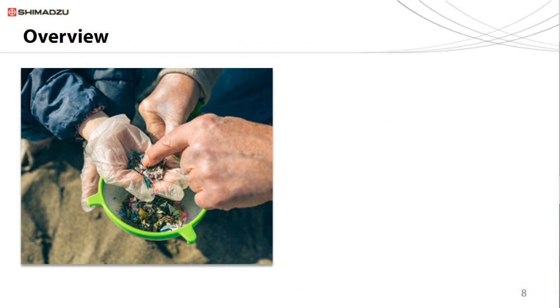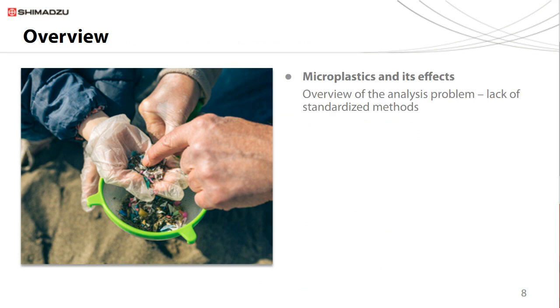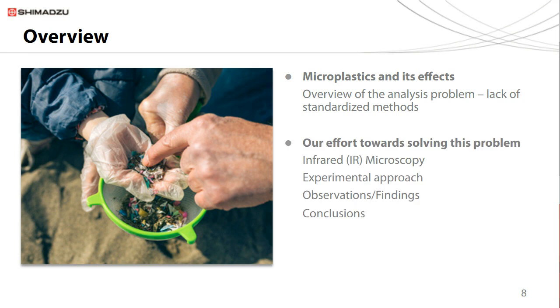Thank you, Ruth. As we transition to the next part of the presentation, I'll briefly provide an introduction to microplastics and the effect it has caused to the environment. Then, I'll touch on how the current lack of standardization is adversely affecting research and advancement in the analysis of microplastics, just to reiterate what Ruth had mentioned earlier. Next, I'll dive deep into some of the specifics of the experiments. There, I'll describe our methodical approach for microplastic characterization, including details, observations, and conclusions.